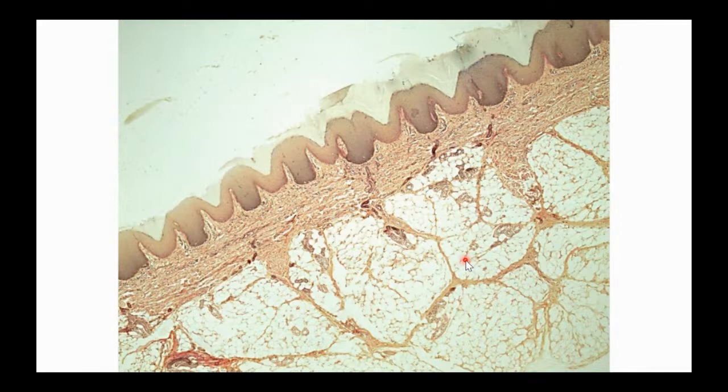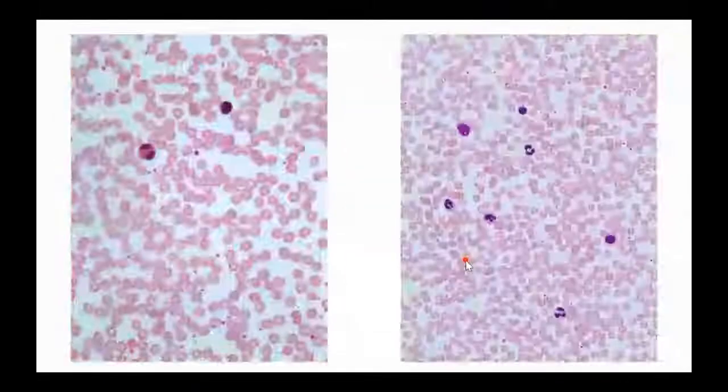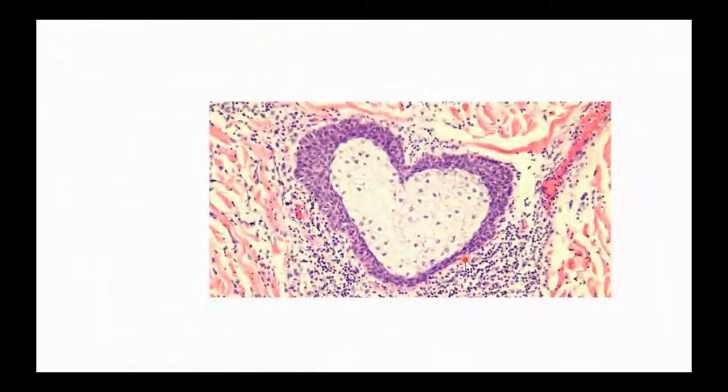Hey, so before I let you go, I just want to pop up. Oh, it's gone. Let me find it really fast. The picture that I put on our bulletin board for the week was this. We have now talked about many of the types of tissue that we see in this picture. So check this out. This is that type of tissue where the proteins go in all kinds of different directions. Any ideas what this pink stuff is here on the outside?